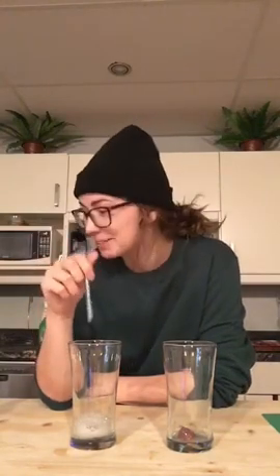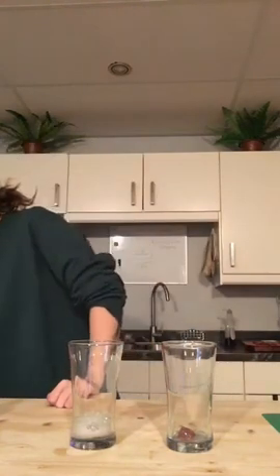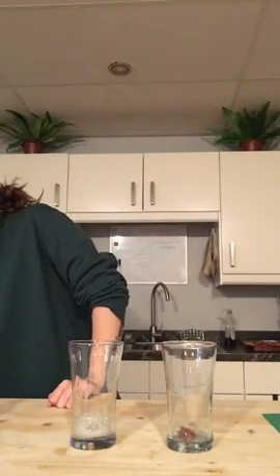I don't know if I'm supposed to be writing the questions in italics down, so I'm just going to say them in the video and I'm going to write them on my report. So the bubbles are basically releasing oxygen. That's the gas. Alright, so that's a 5.